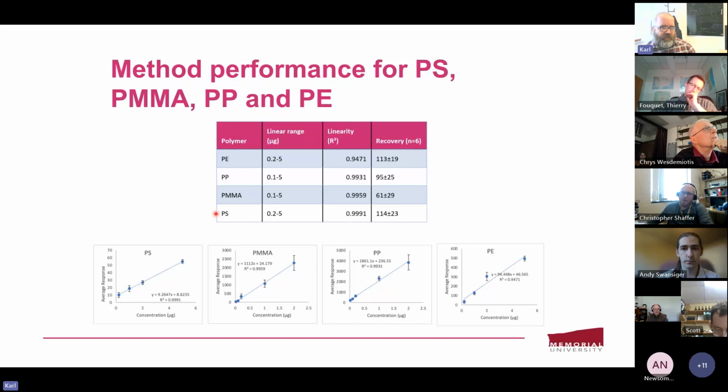I would expect polystyrene and polybutadiene to break bonds more easily because they are allylic bonds, lower in strength than polyethylene. The C-C bond is the strongest. Right, so we would hope that would be captured by preparing the external calibration.